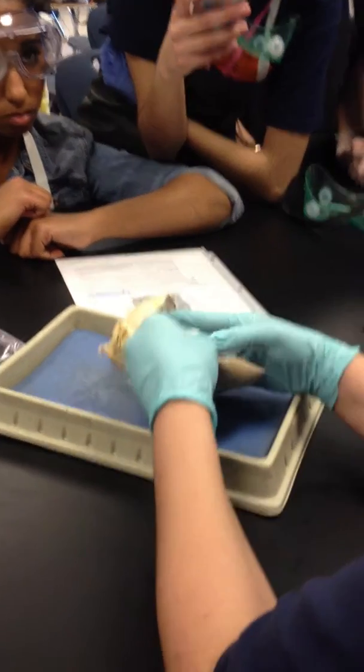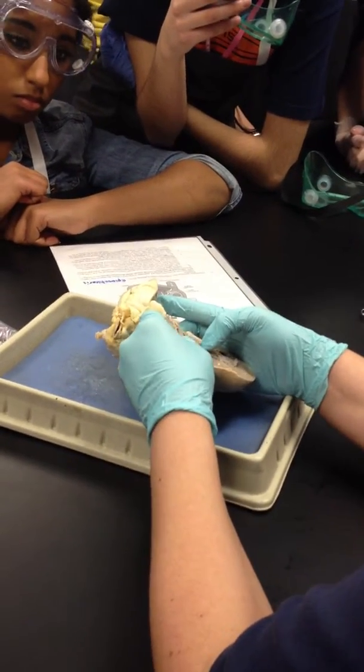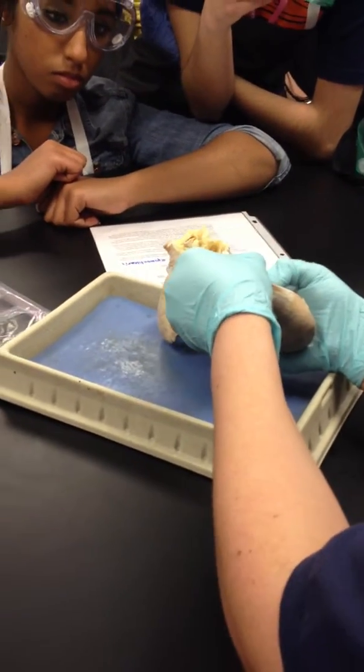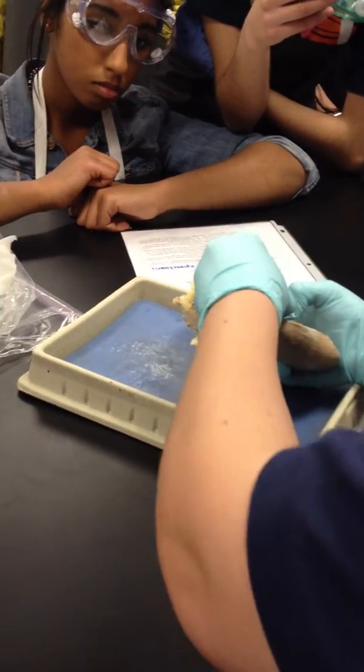Here's your AV valve. This is going to be your tricuspid valve. It is going to be anchored. You can see the little anchors here, those little string-like tendons, the chordae tendineae, and they're going to be attached to the papillary muscle. So wherever they're attached down here is papillary muscle.